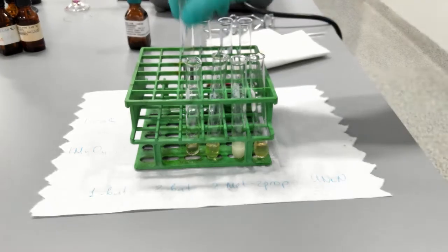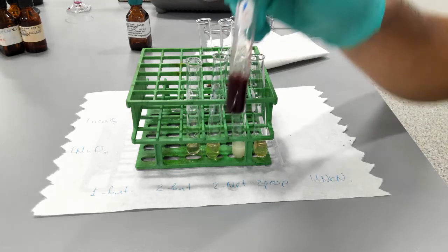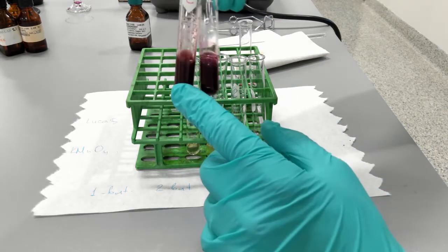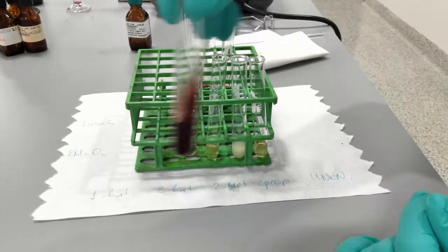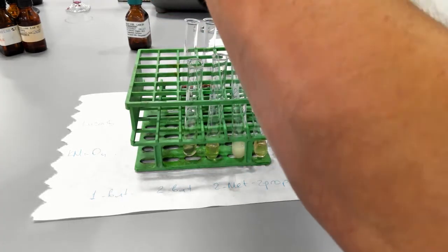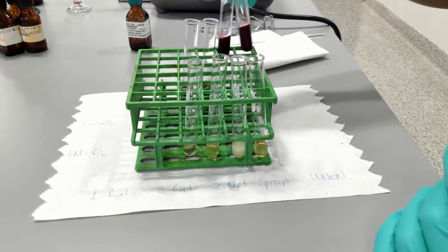In the meantime, let's take a look at our results with potassium permanganate. You can see the difference between the primary and the tertiary. You can see a profound difference between secondary and the tertiary. Now this is our unknown, so let's take a look. It's definitely not tertiary.